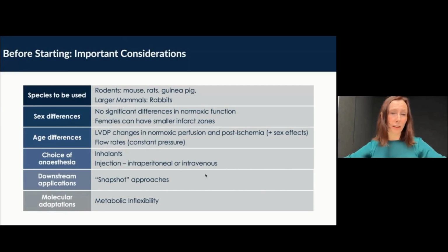What about our choice of anesthesia? This is another lesson I learned the hard way, and we'll come back to it in a little bit. But it's important to know that the options available are either inhalants or injections, but pick one. By all means, only pick one. Don't try to go across multiple.